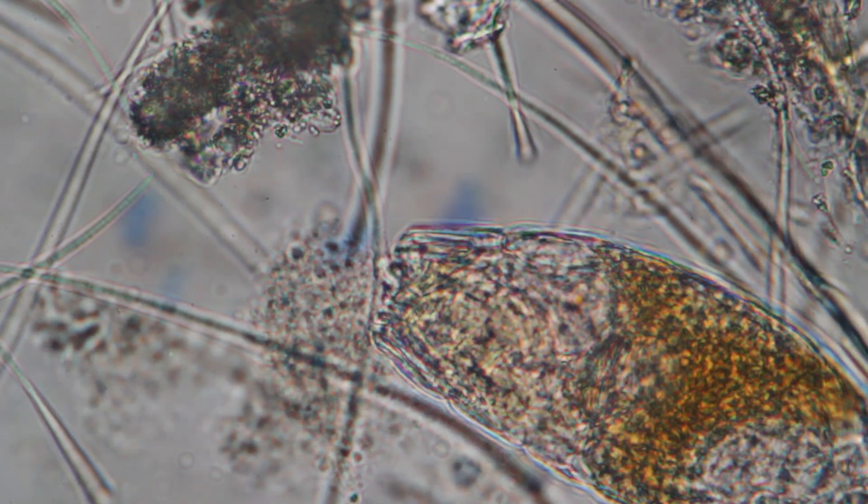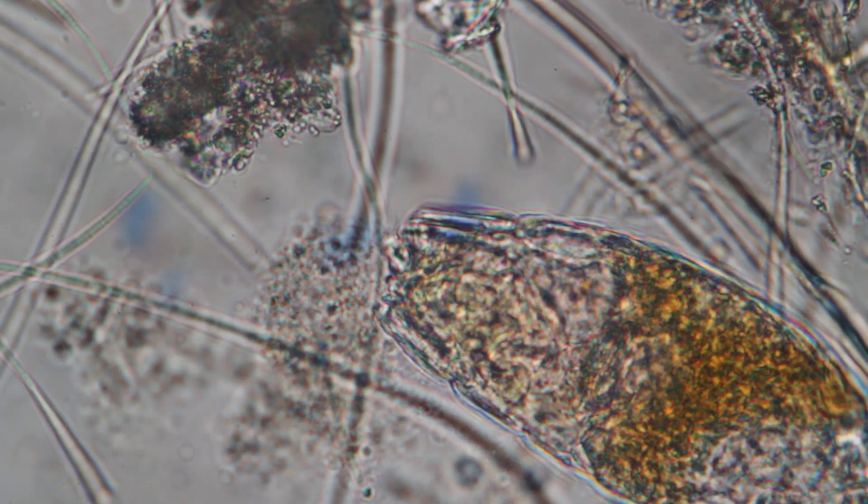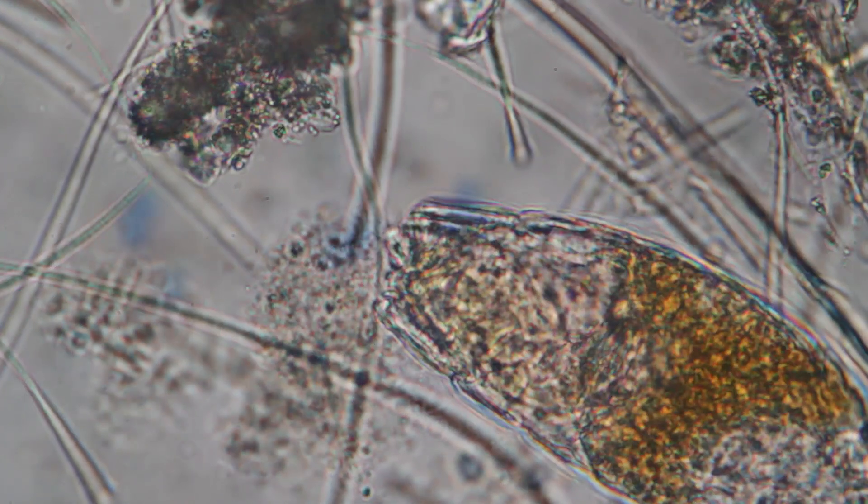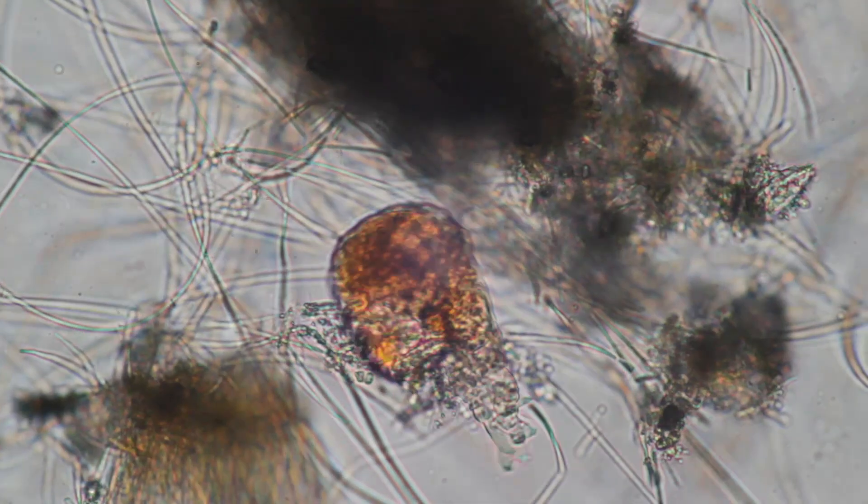I did not find a lot of these organisms in the sample, and I think one of the reasons is that taking the sample by scratching it off probably destroyed and killed many of them.